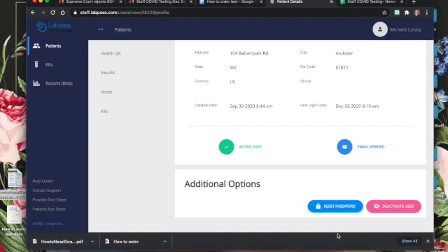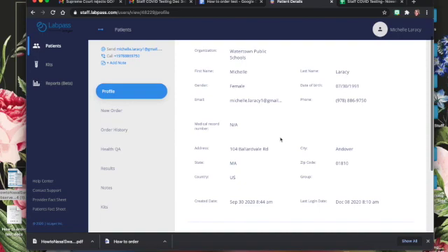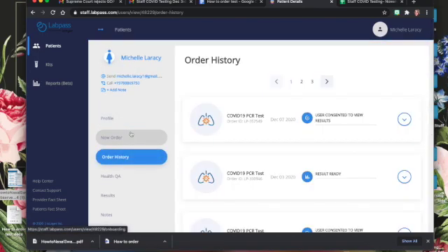And in case someone has made multiple accounts, which will happen fairly often, ask them which account they want to keep active, which email, and then just deactivate the users that you don't need so you're not having multiple accounts and just confusing yourself for the most part.